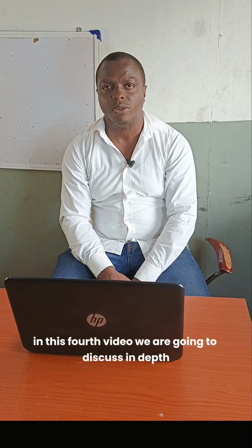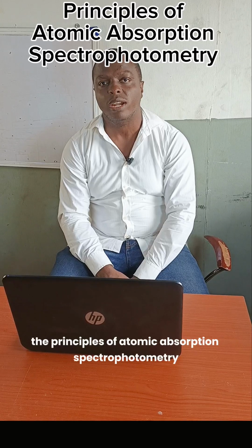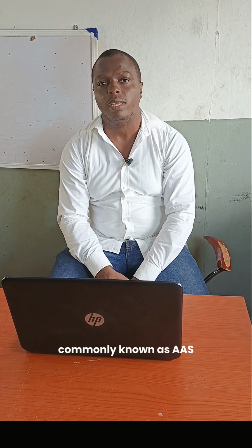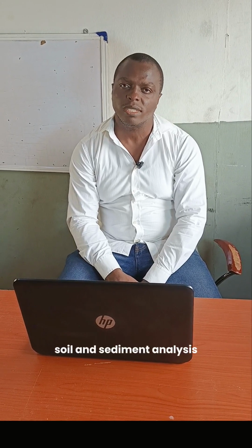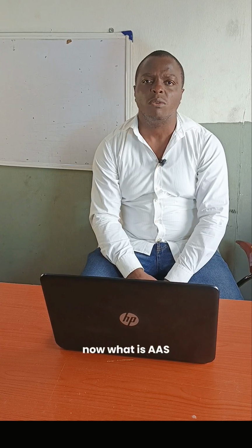In this fourth video, we are going to discuss in depth the principles of atomic absorption spectrophotometry, commonly known as AAS. Atomic absorption spectrophotometry finds application in water and wastewater analysis, soil and sediment analysis, food, drugs, geological samples, and a host of sample analysis. Now, what is AAS?